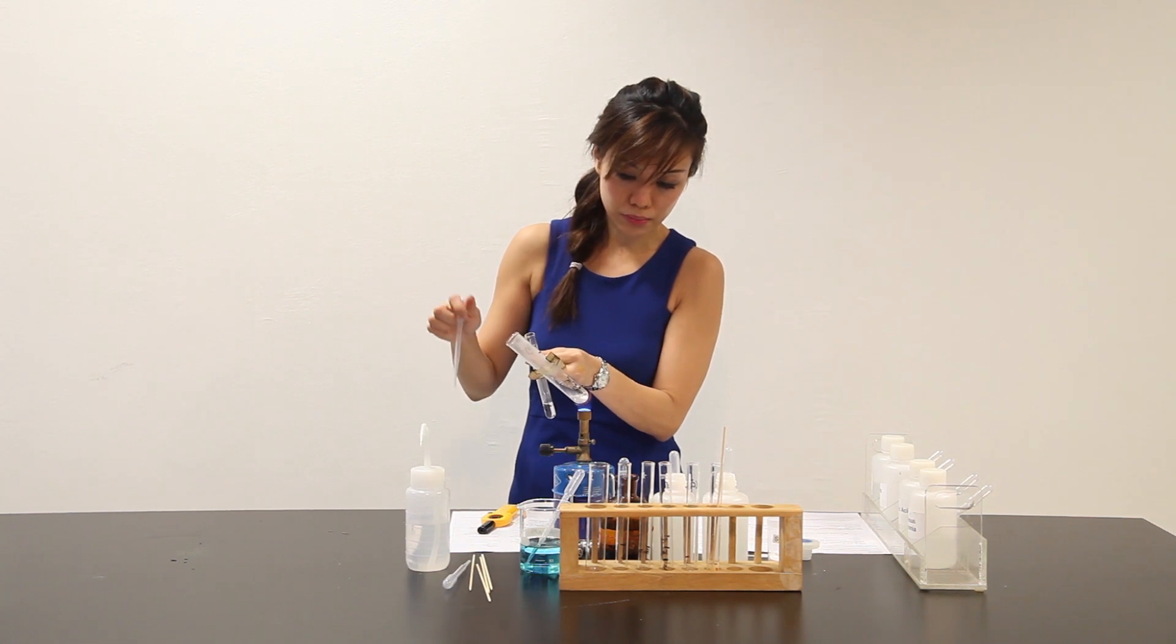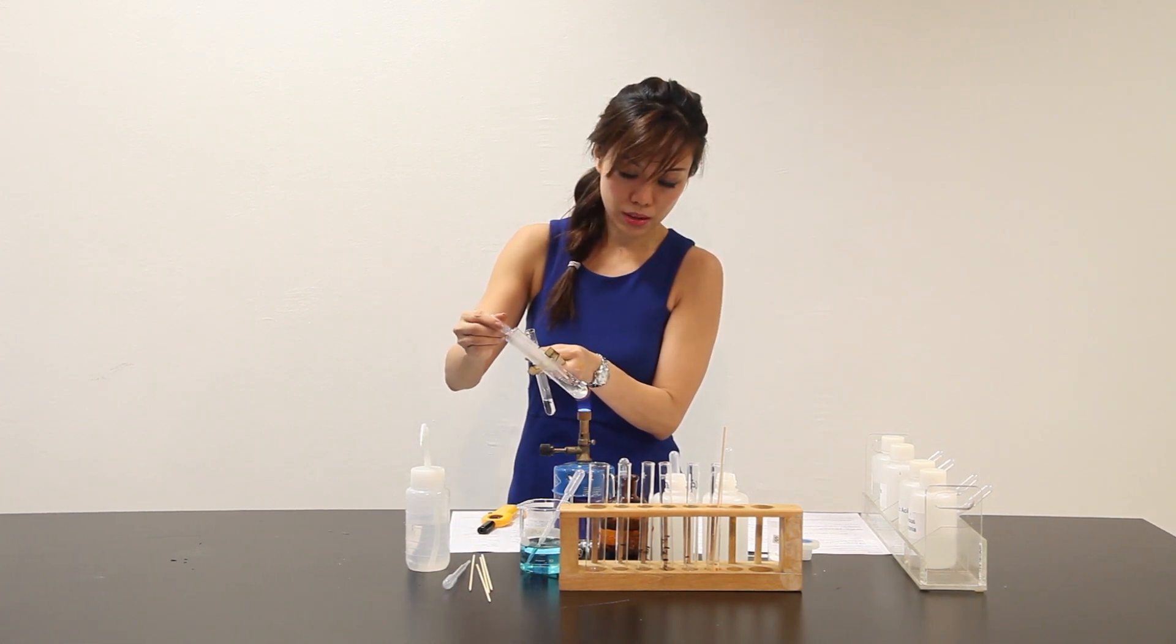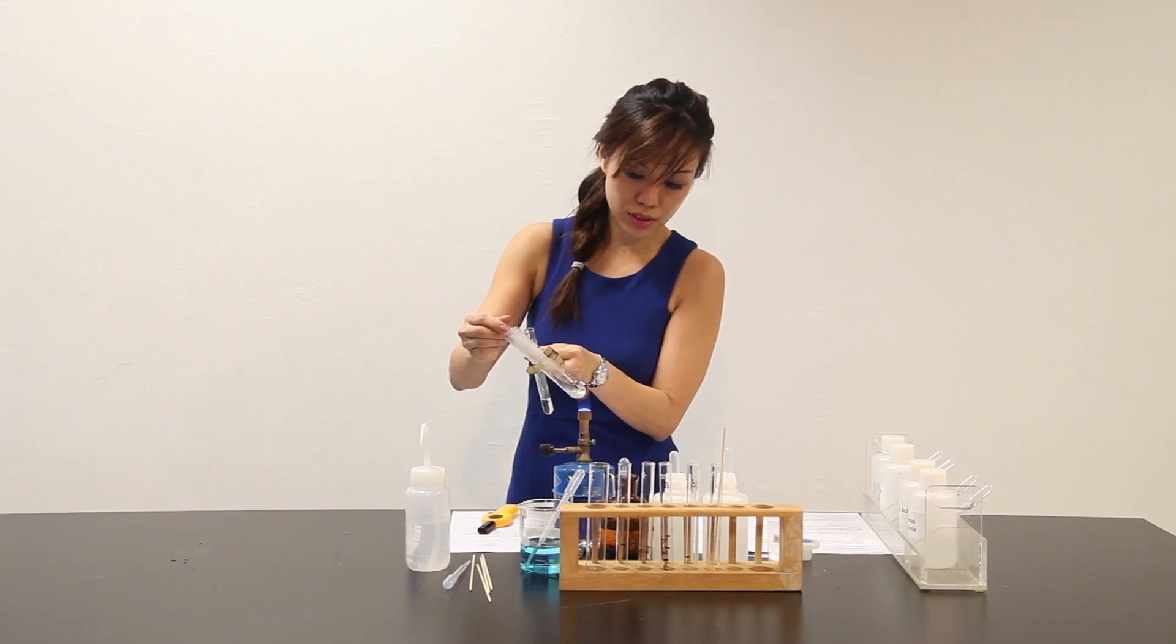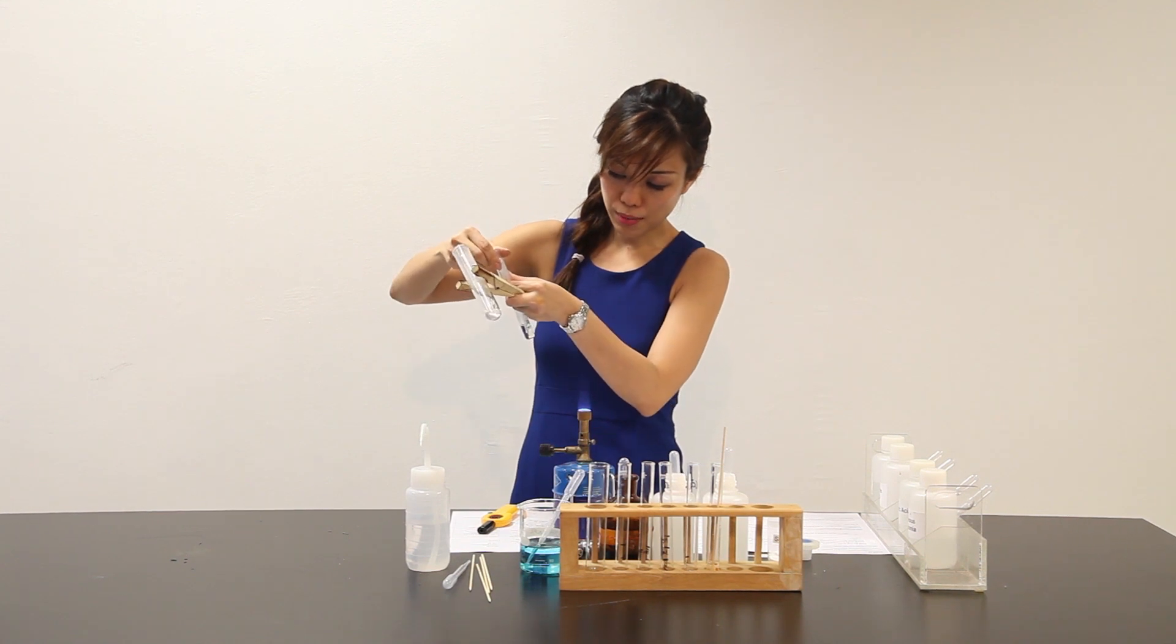Heat some more. Put your tip pipette in. Count one thousand, two thousand, three thousand. Take out again. Bubble through the lime water.